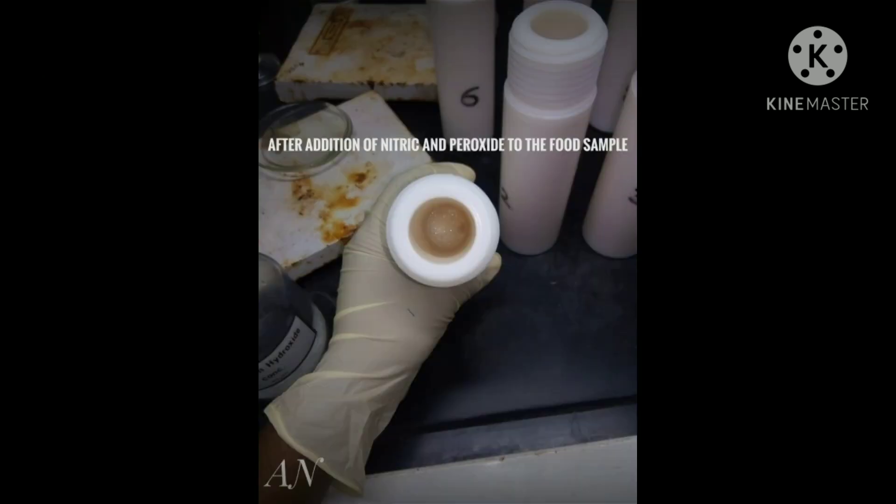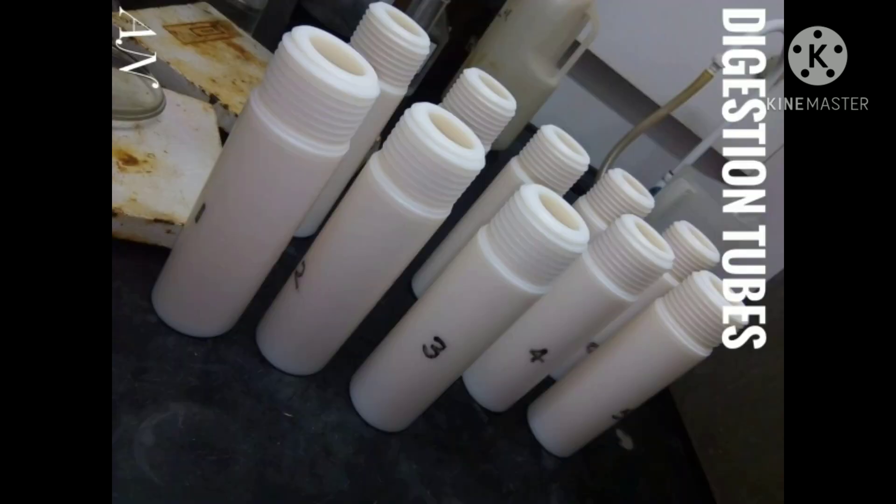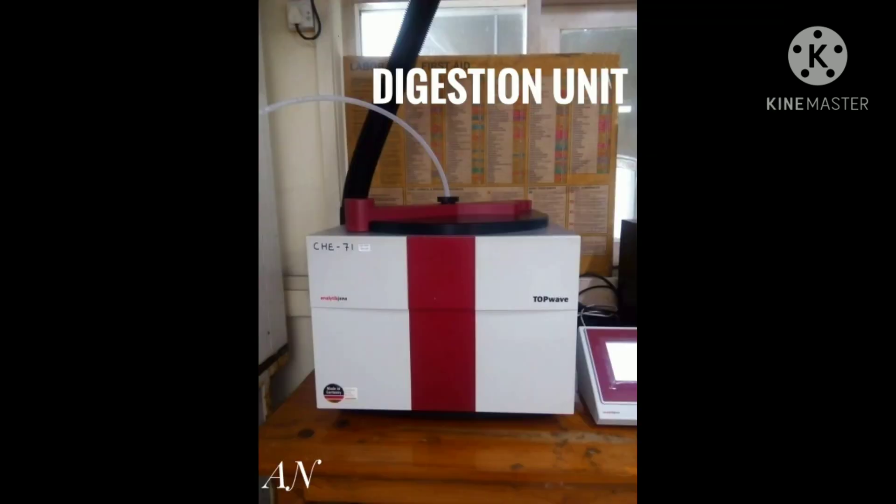The first step is one gram of food sample was weighed and transferred to the digestion tube. Second, eight milliliters of concentrated nitric acid and two milliliters of high-purity peroxide were added to the tubes under the fume hood. Third, the tubes were closed tightly and allowed to sit for 24 hours. After that, the tubes were opened to release pressure, then closed again very tightly before placing in the digestion unit.